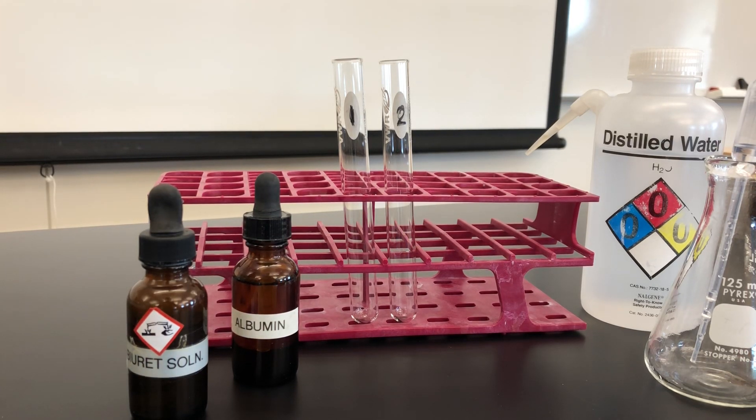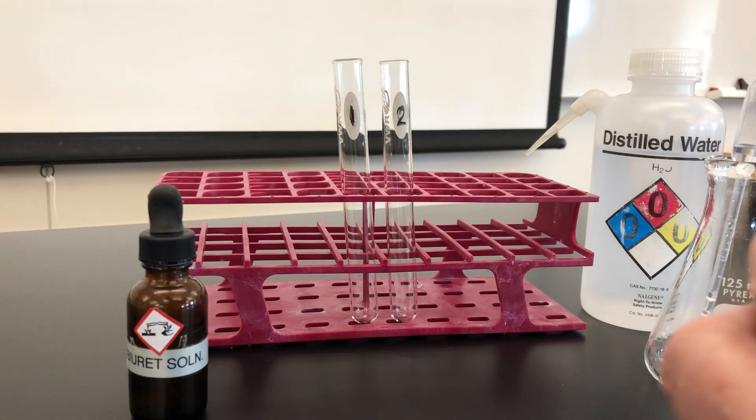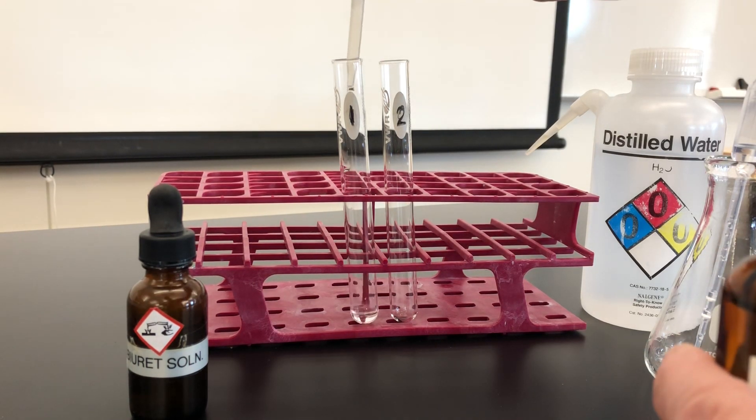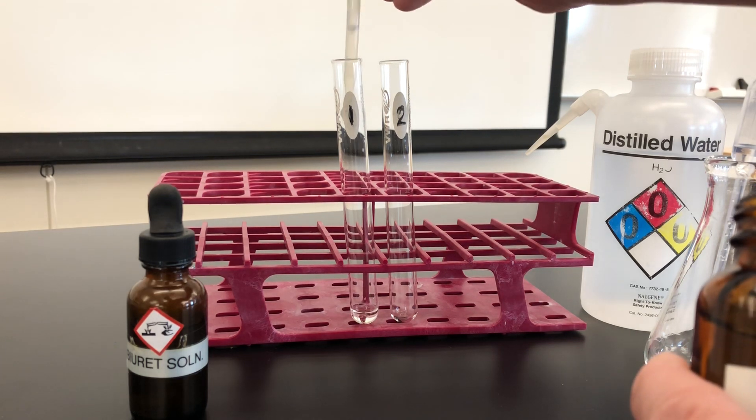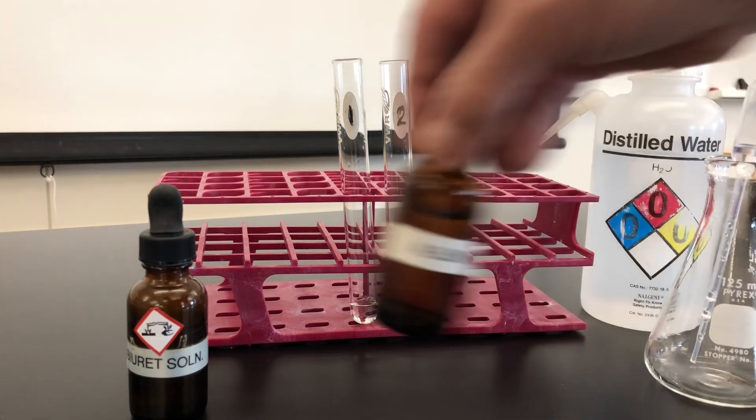Our last test is for protein and we're going to use a reagent known as Biuret. I have the same test tubes labeled number one and number two, and to the first test tube I am adding two droppers full of albumin. Albumin is essentially purified protein from egg whites.